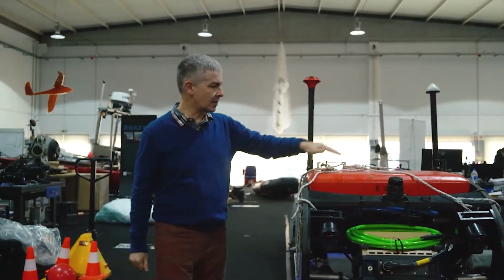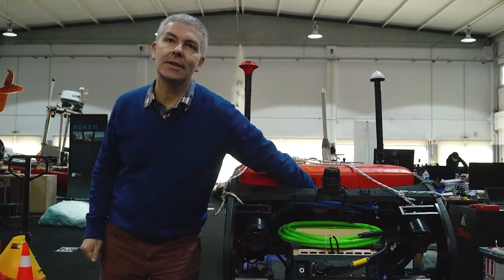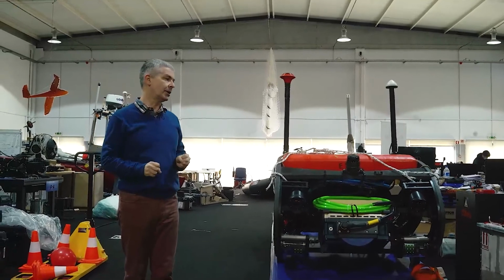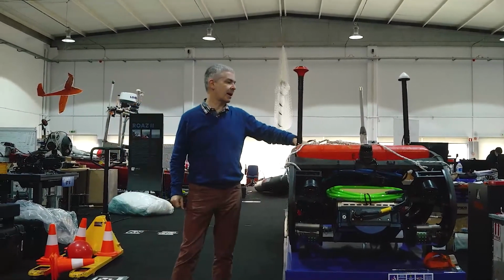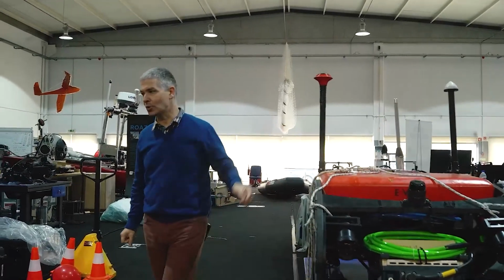We cannot see it here, this is the foam, but inside we have two cylinders that house the electronics. We have the computer inside a metallic cylinder and a set of batteries that you can take out and change in the field. We have been using this at sea.